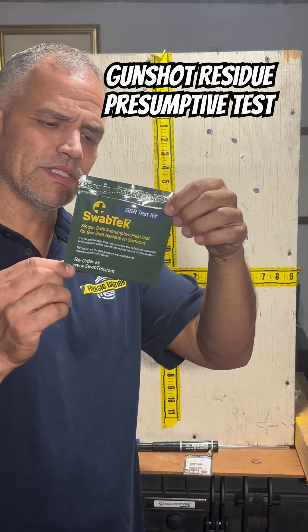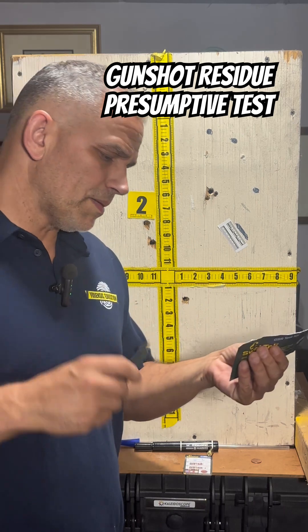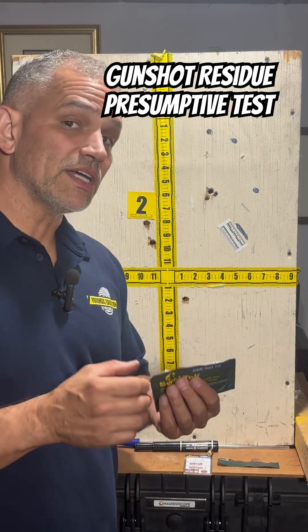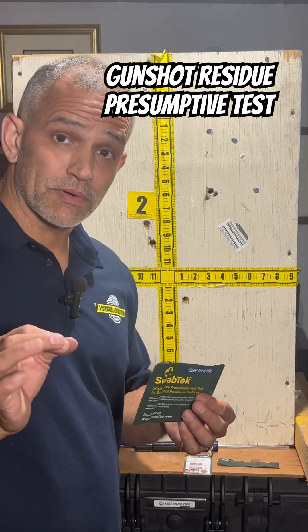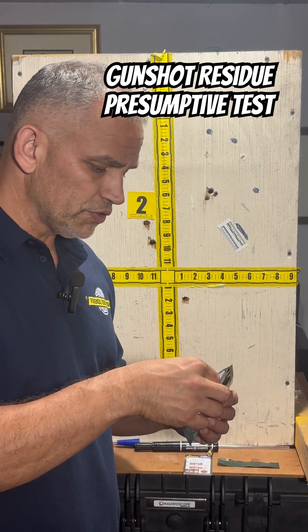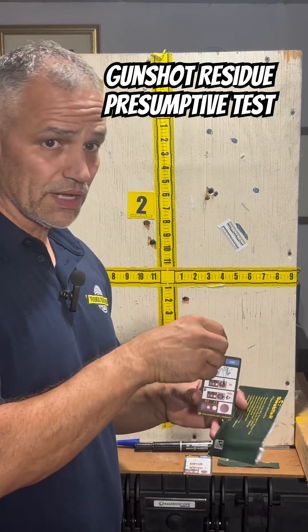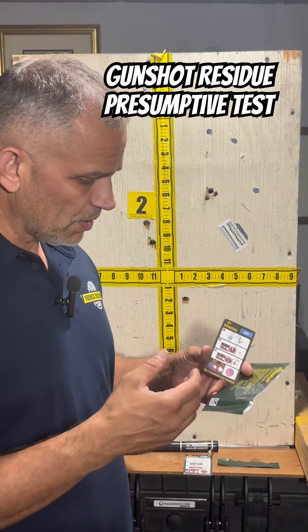This is SwabTek. It is a presumptive preliminary test for gunshot residue. We're going to open up that package. What this is testing for is copper and zinc, which is very common in gunshot residue. Once the primer is struck, it's going to shoot out copper and zinc along with barium, lead, and antimony.